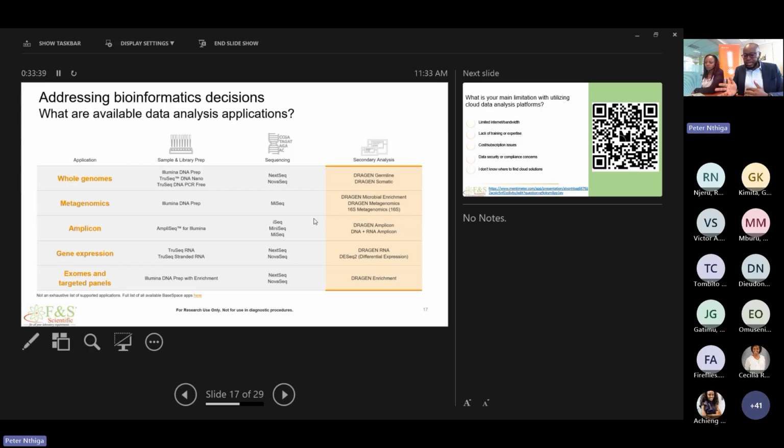We have tertiary analysis. This is a deeper analysis solution where you can get more insightful information beyond what is provided from a secondary analysis point of view. So again, it makes a lot of sense to see what is available and whether it addresses your specific objective before exploring other tools. There's nothing wrong, of course, in exploring other tools.